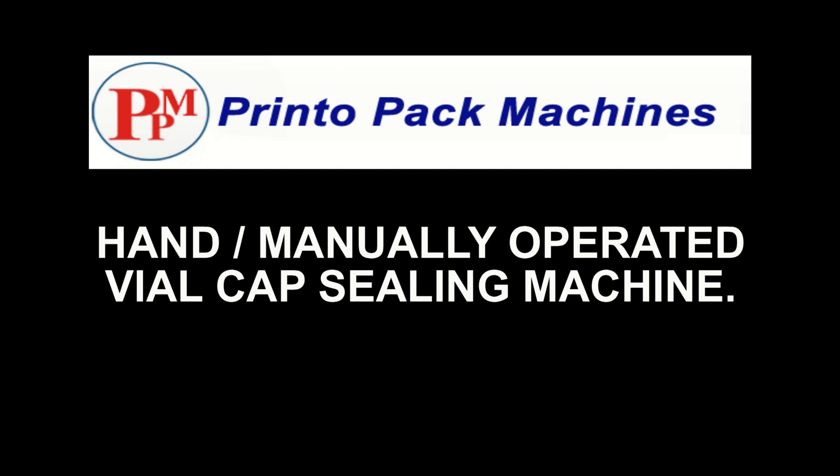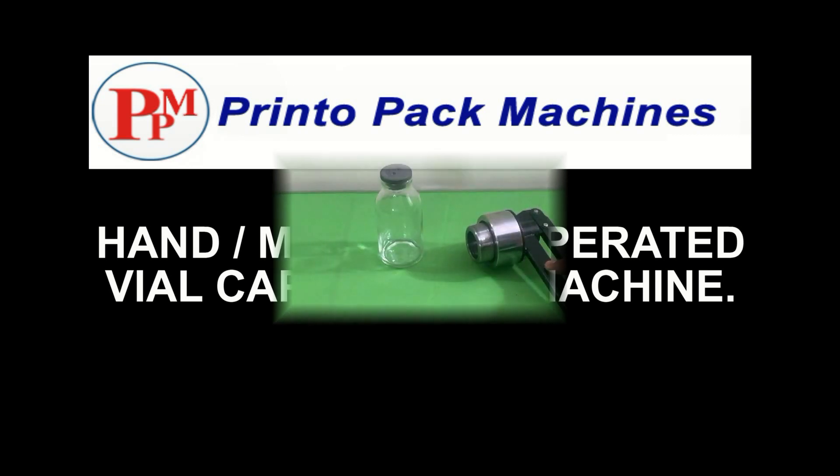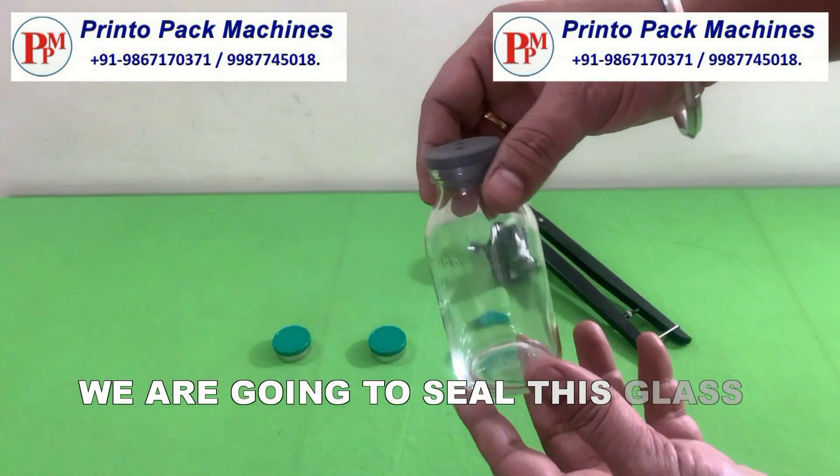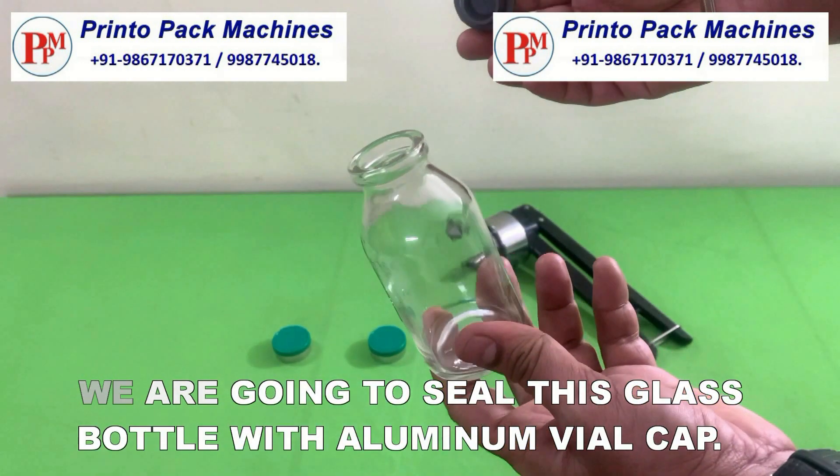Hi friends, welcome to our hand manually operated vial cap sealing machine's demonstration video. We are going to seal this glass bottle with an aluminum vial cap.